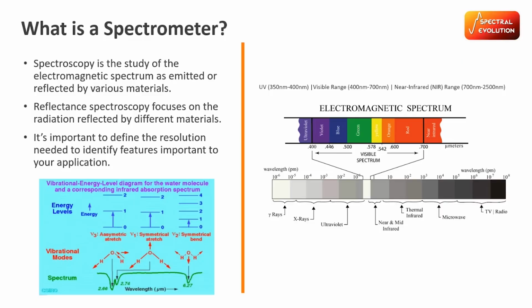It'll use that as a reference, and then it will calculate a ratio between what amount of light bounces off of a white plate and what bounces off a material to give you the chemical structures and absorptions of any given material. So that's how reflectance percent is used and how a spectrometer uses it.